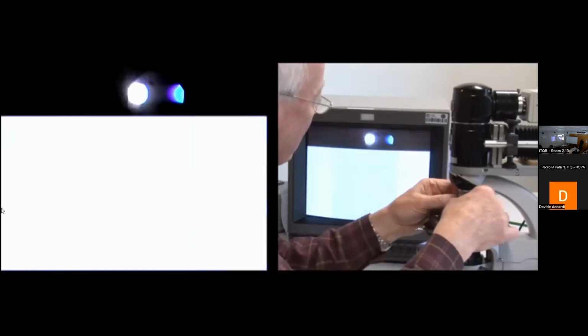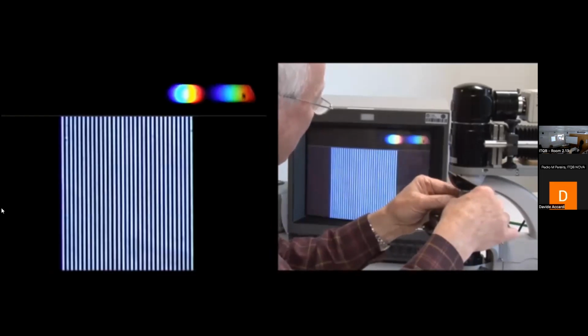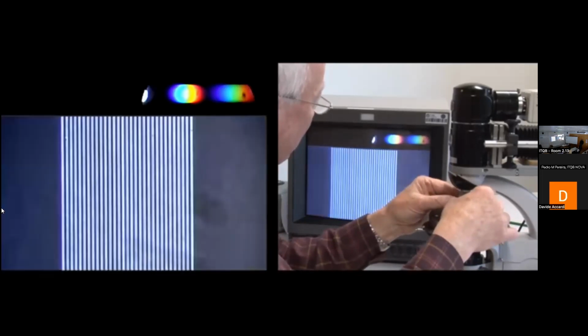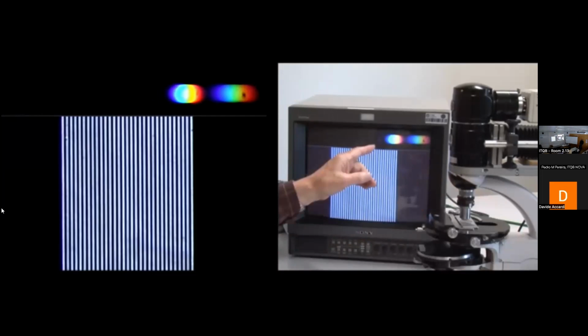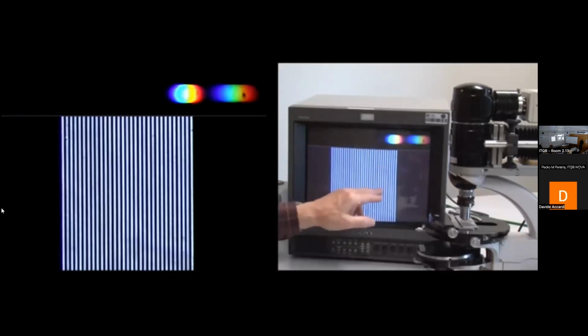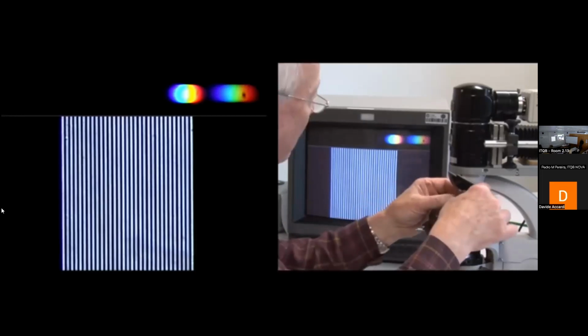What about the second order beam? Now here we have the first and second order beams of the fine grating and no zero order, and we are resolving. Yes, the image looks a bit different, and we'll come back to the reason for that difference in a minute, but we are perfectly well able to resolve those lines. So it looks as if we need two beams.